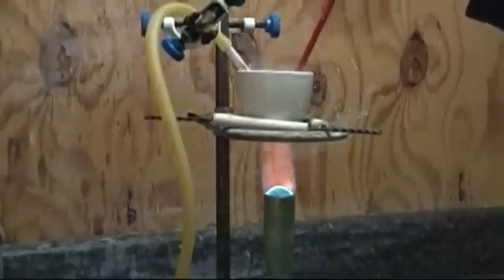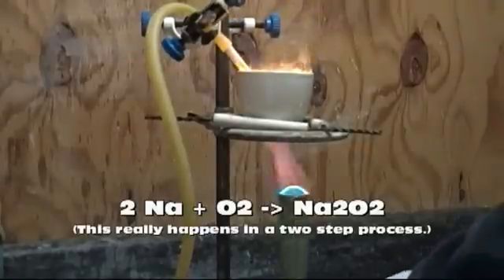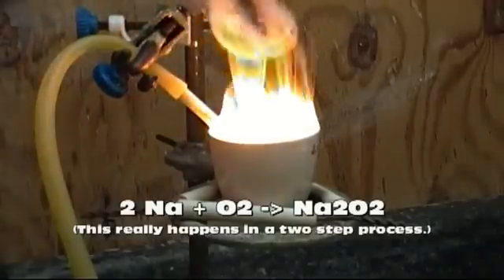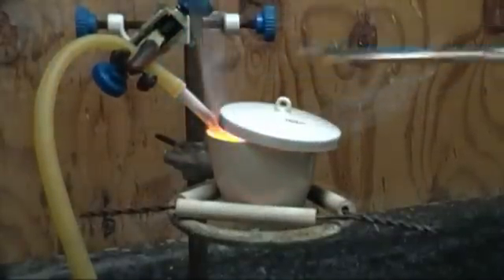Continue to heat the sodium until it ignites, then quickly remove the heat source as the rest of the reaction is self-sustained. I now turn on a very small stream of oxygen to the reaction vessel. It is very important not to overdo the O2, as this will heat the reaction to the decomposition point of the peroxide. Plus, too much O2 causes a lot of sputtering.